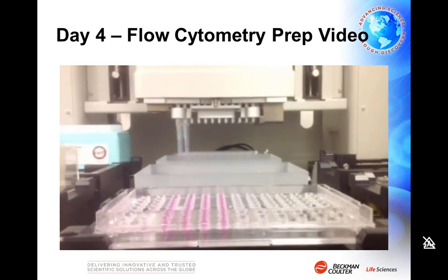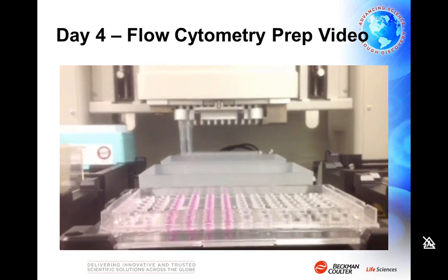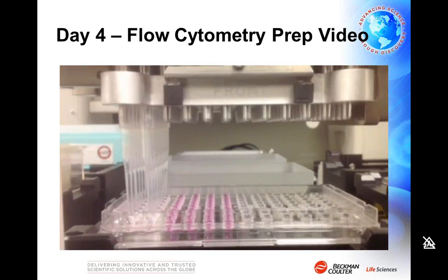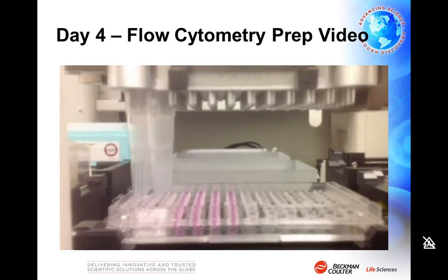And here you'll notice, hopefully, you'll be able to see the pod move to the left. And again, that's an illustration that shows the fine-tuned pipetting. We wanted to aspirate from the side of the well so that we didn't re-aspirate the spheroid as it sank to the bottom. We then used PBS to rinse out the wells, essentially.